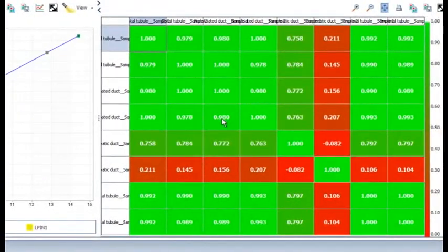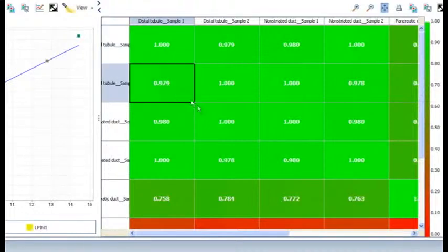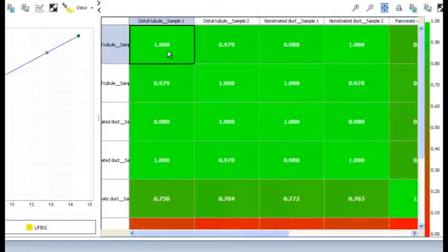The screen to the right is a signal correlation plot and presents the correlation coefficient, or R, for each pair of samples inside the appropriate box. I'll just click this plus sign so we can read our rather long sample names. Okay, so the way this works is, the greener the box, the closer the value of R is to 1, and therefore the more correlation between the 2 samples or biological groups in terms of either CT or delta CT.